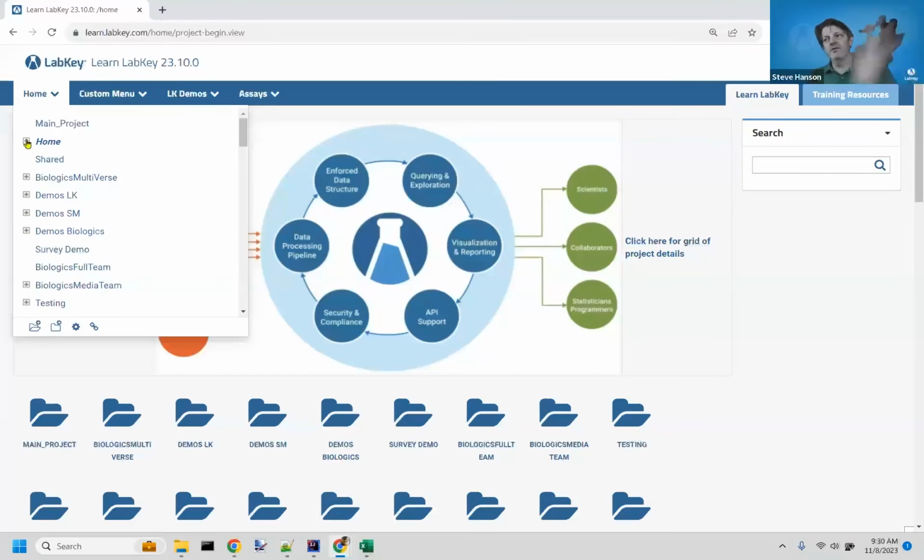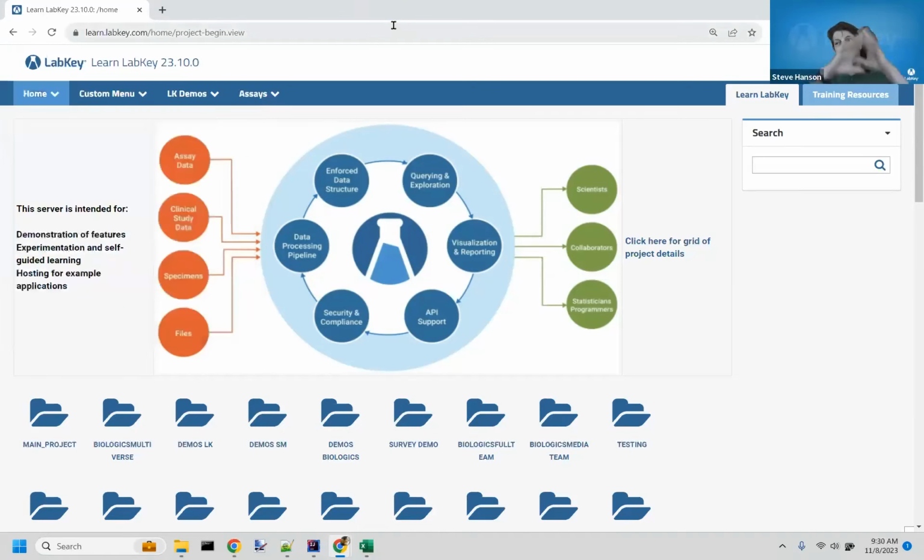Or let's suppose you configure some security. You say this project can be shown to users A, B, C, and D. Well, that's also a configuration that you can apply to all the subfolders or not. But it can be very convenient to have that kind of shareable configuration that spans many folders.